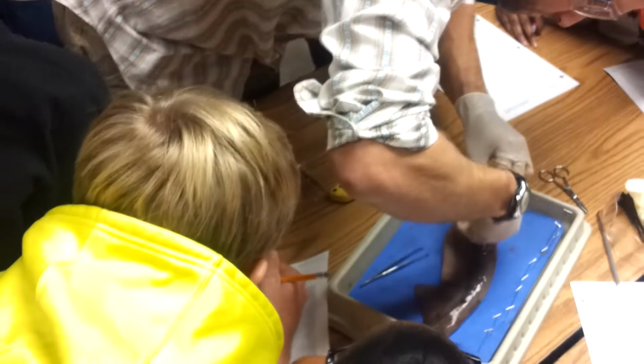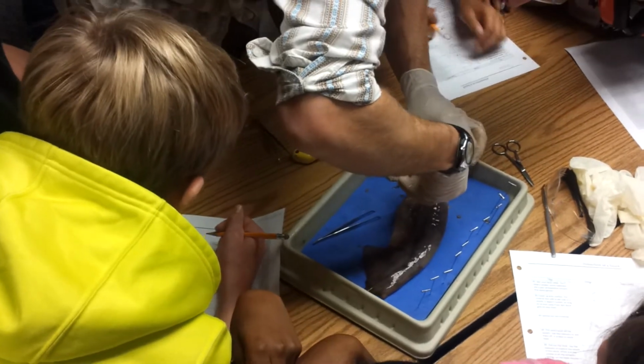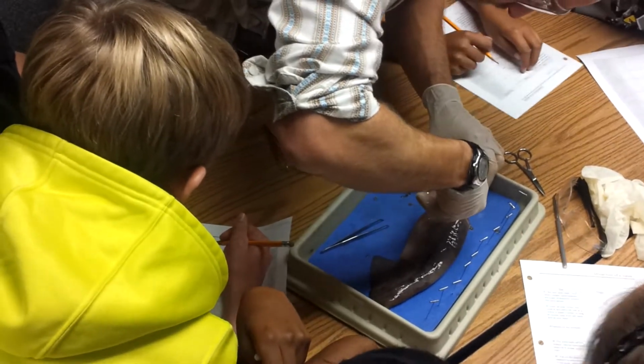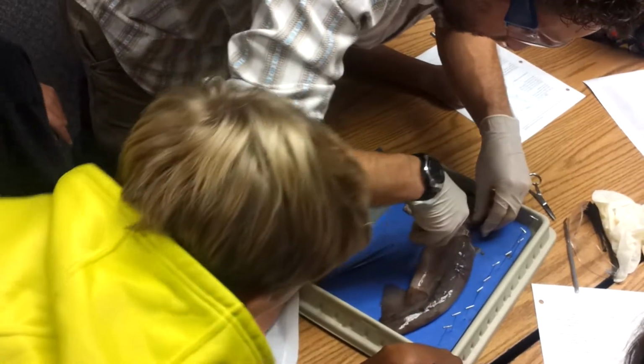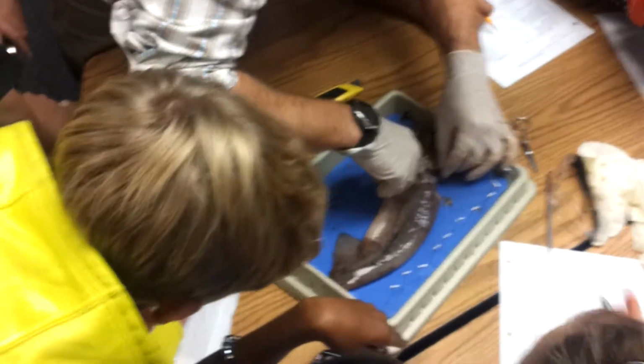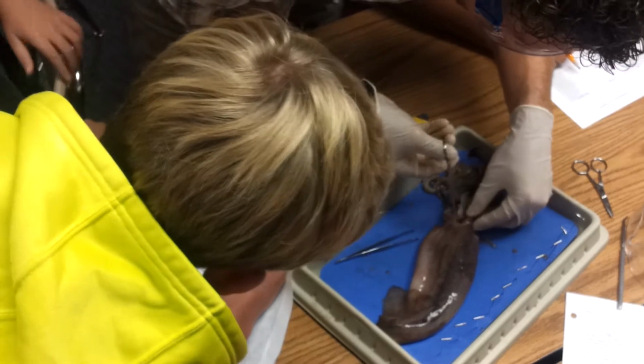This is surgery. He's cutting. Oh, my leg. Guys, you know calamari? That's what you eat when you eat calamari. Really? Look at that thing. I've never eaten... All right, that's the brain. Oh, the brain's up there. Well, he didn't open that part. Ew, I saw that.